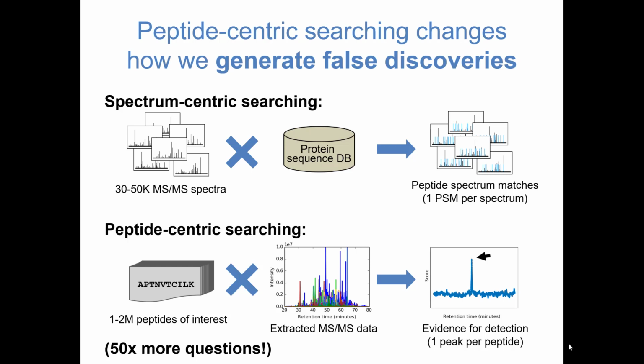I'm kind of a bit confused. Shouldn't we be comparing our libraries against the databases? It's kind of the other way around. I would argue that spectral libraries in DIA, and this was my actual point, are smaller than FASTA files from UniProt, and that's what you said.